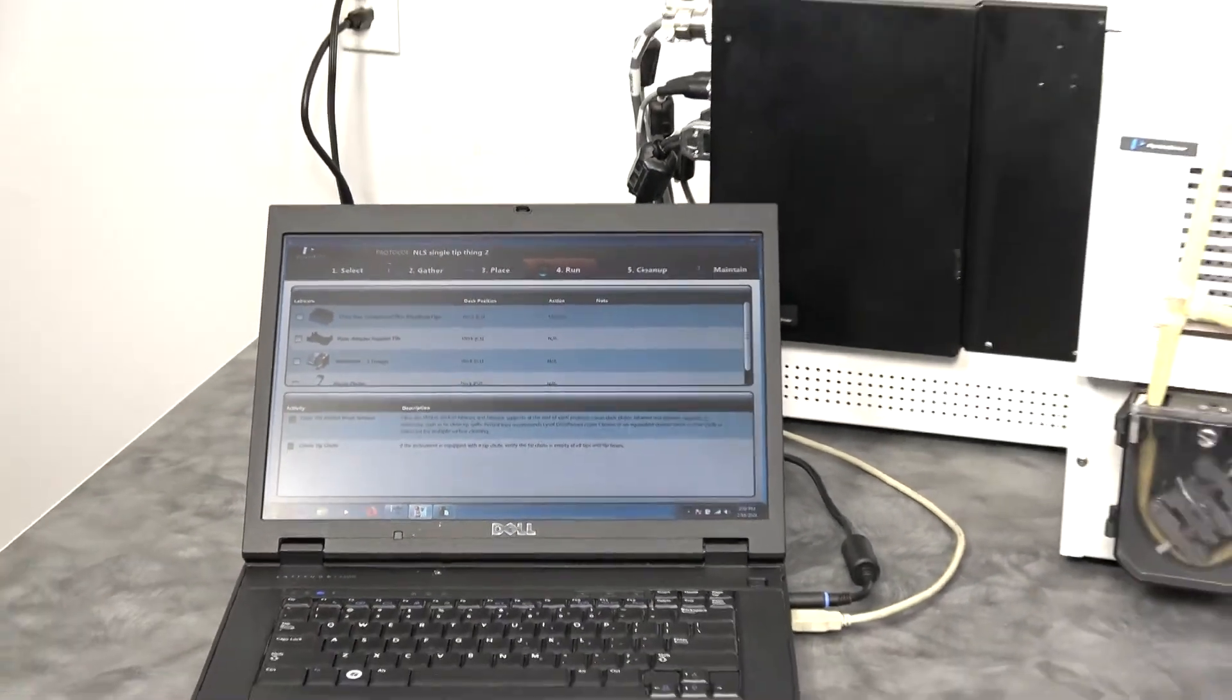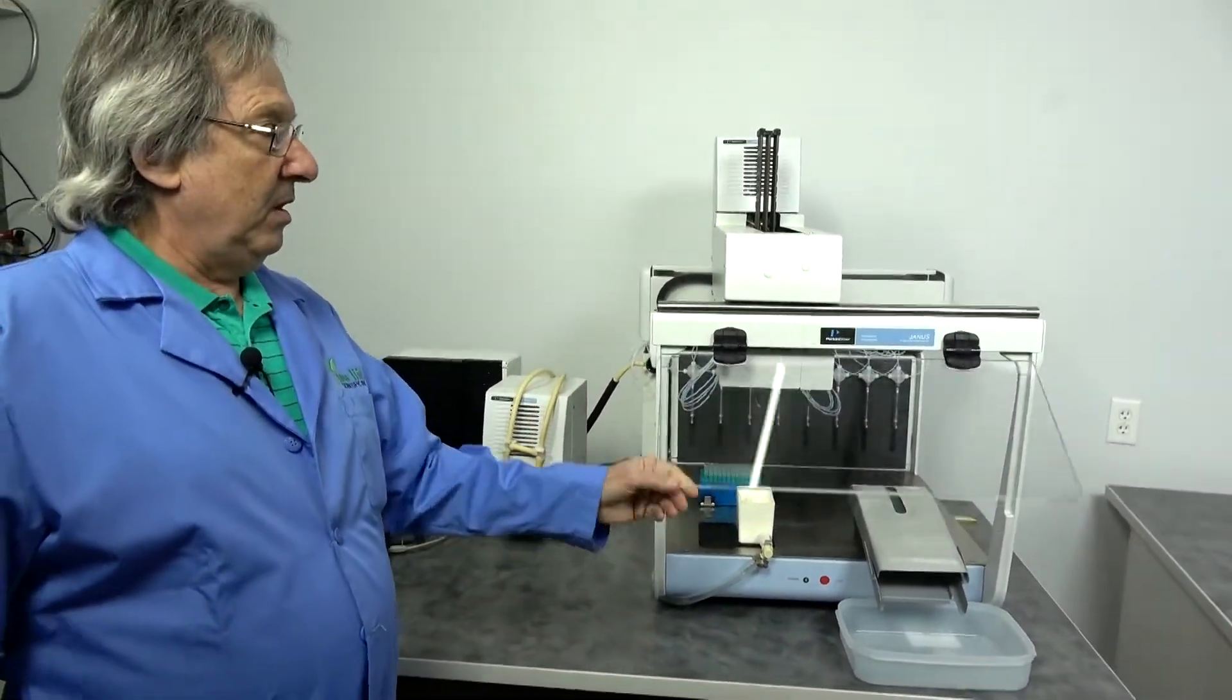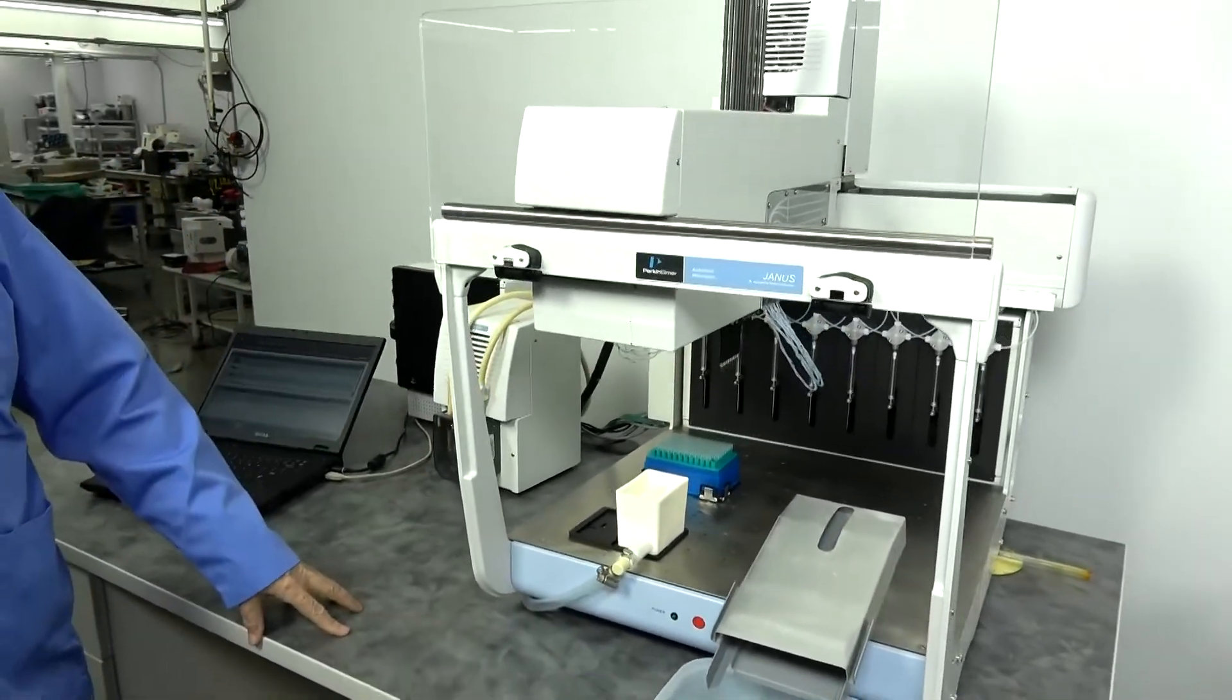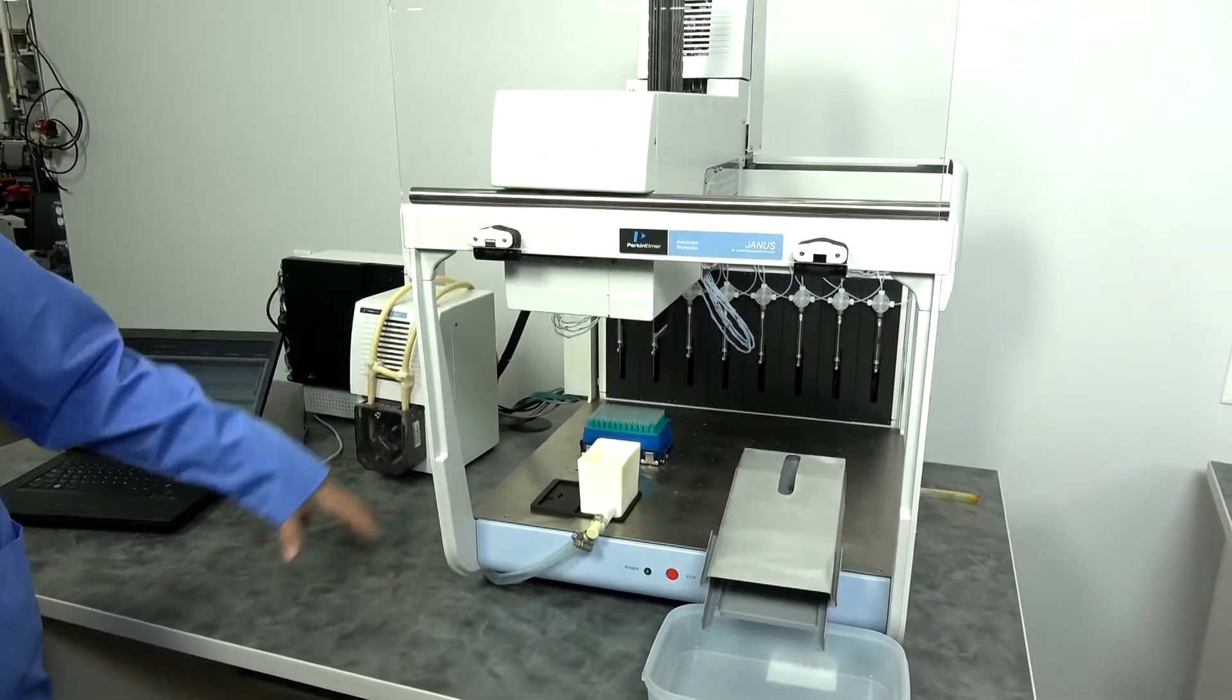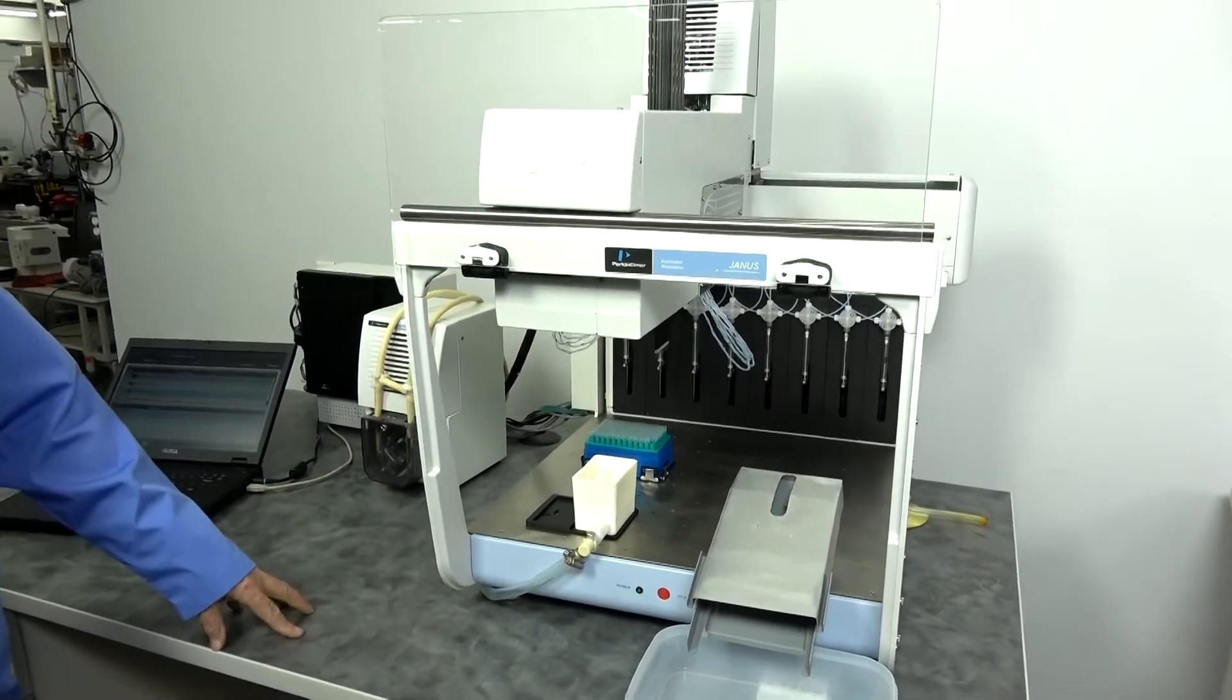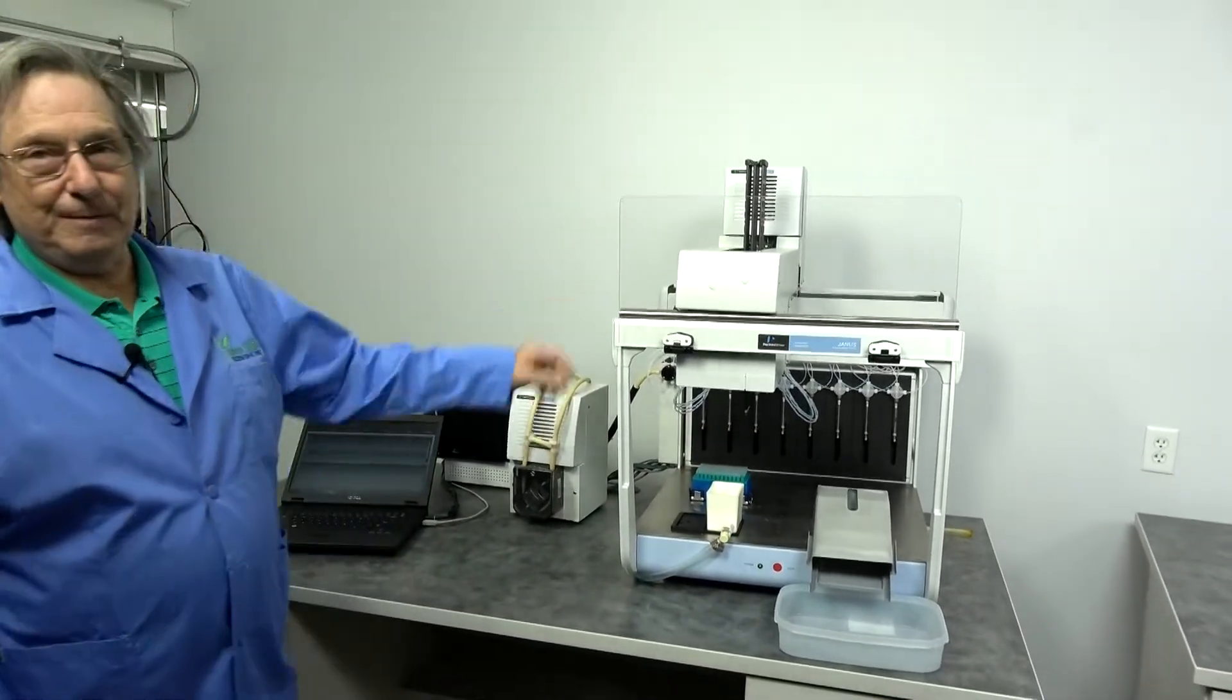That's the Janus Mini system. They are available in different sizes and lengths, but this is great for small labs that maybe don't have a lot of space or don't need a lot of different deckware available. This may be the unit for you, and it's going to be available in our Cridersville location. Thank you very much.